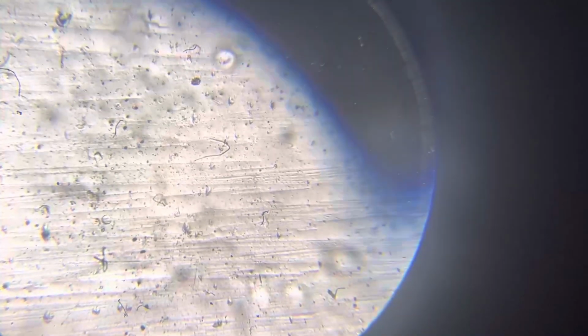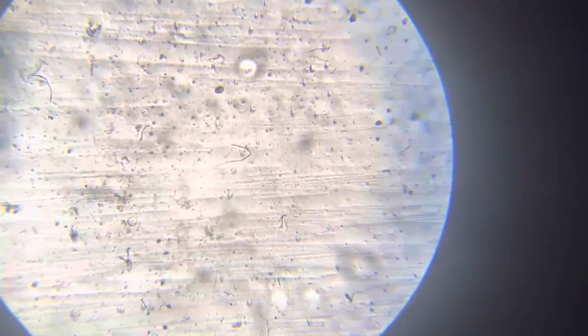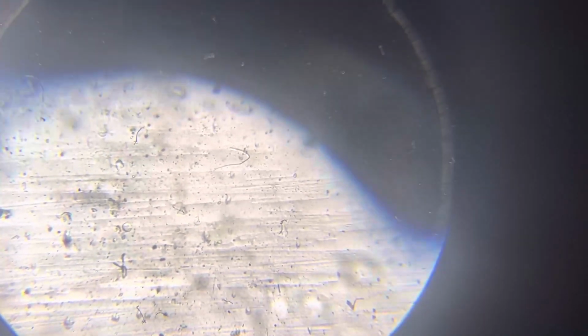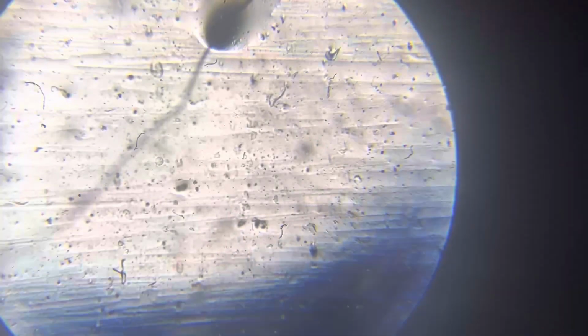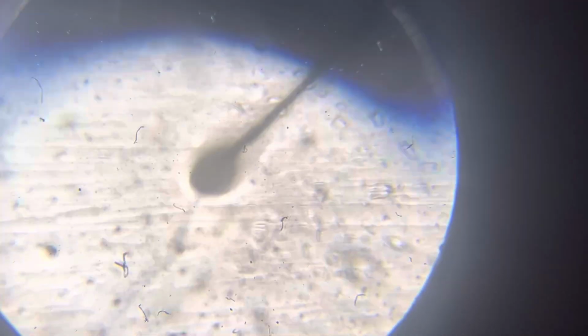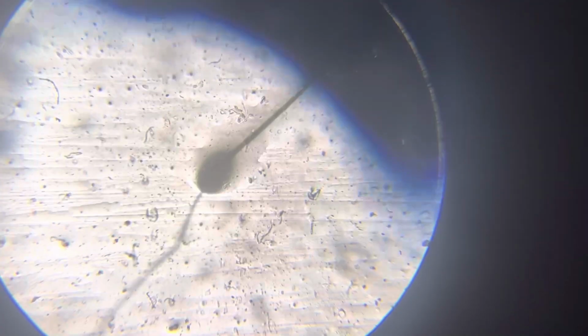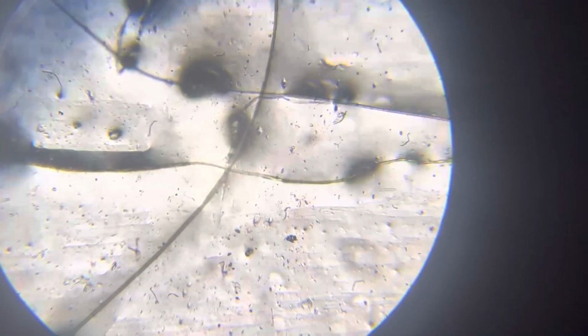So this was taken from down under, not from the upper floating layer, but from deep under. So it's mostly water, very liquidy, almost not observable outside of the microscope. Very, very nice.